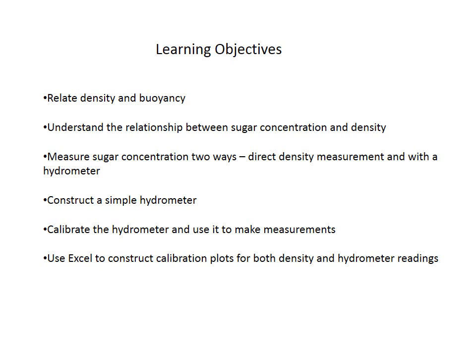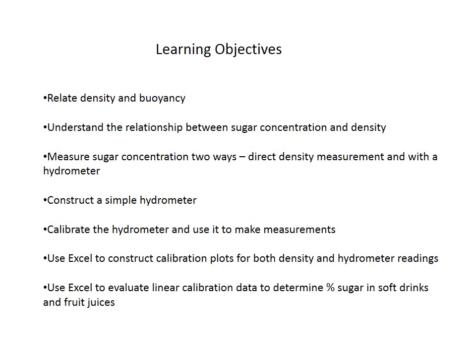And you'll be able to use Excel to construct calibration plots for both the density and the hydrometer sets of readings. And also use Excel to turn those evaluations of calibration data into actual percent sugars. So that's kind of what we're looking for in this particular lab.